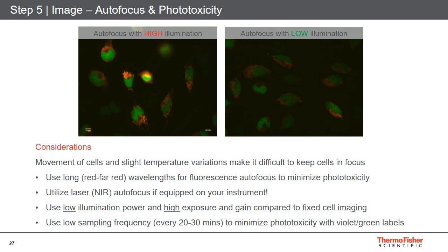And so this is where we of course need to use some type of auto-focusing routine in order to keep your image in focus, and most commonly this is performed by using the fluorescent signal itself. We'll run an algorithm that will take a small z-stack through a volume, and then that z-stack will interpret where the signal is essentially the highest in order to keep that signal in focus. But what this results in is a whole lot of extra light going into the system and exposing your cells. And so this can actually result in a fair amount of phototoxicity.